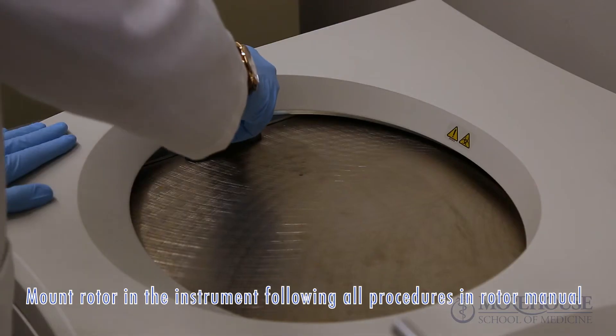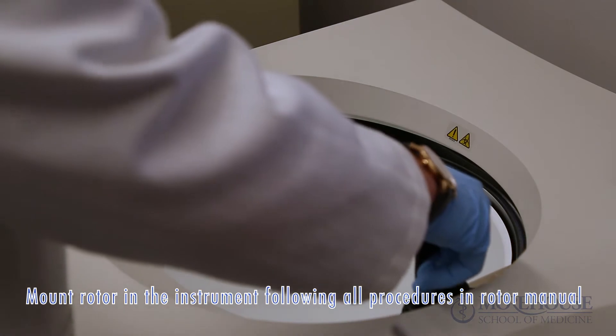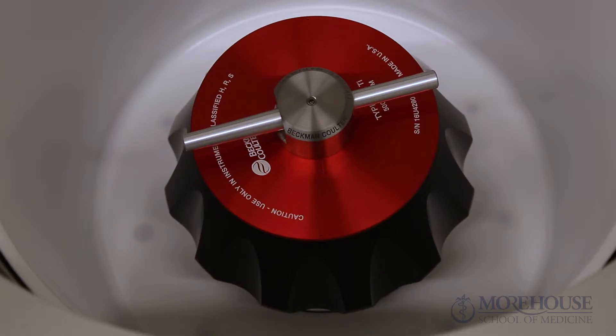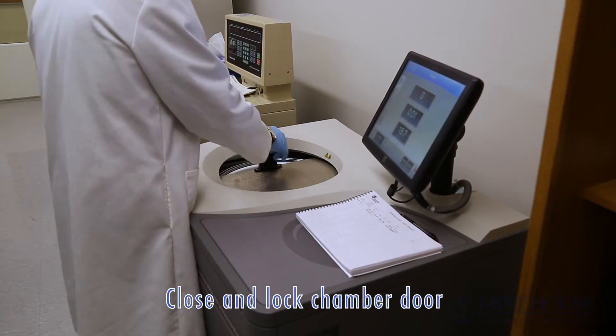Mount the rotor in the instrument following all the procedures in the rotor manual and observing all safety procedures and cautions. Close and lock the chamber door.